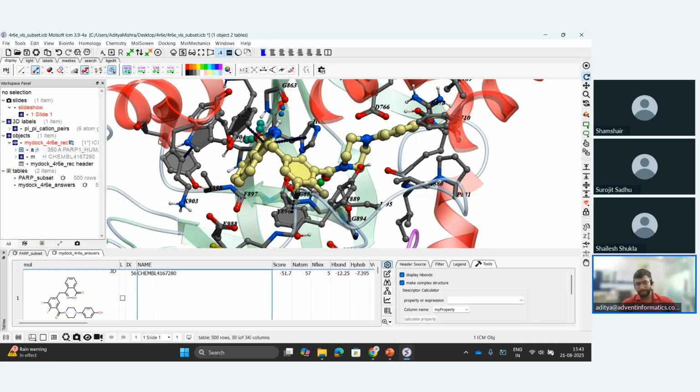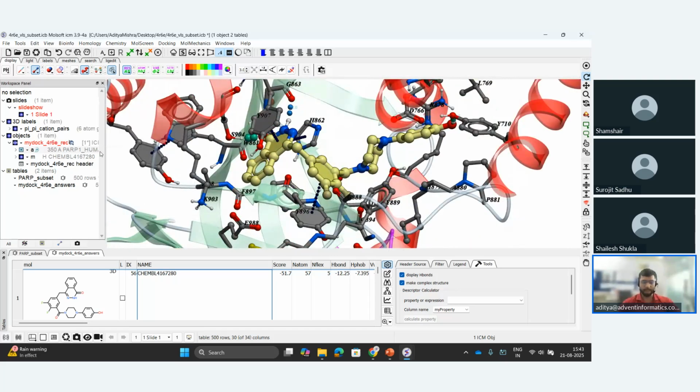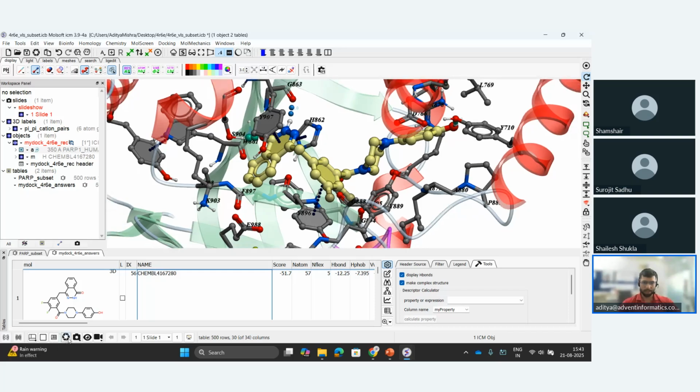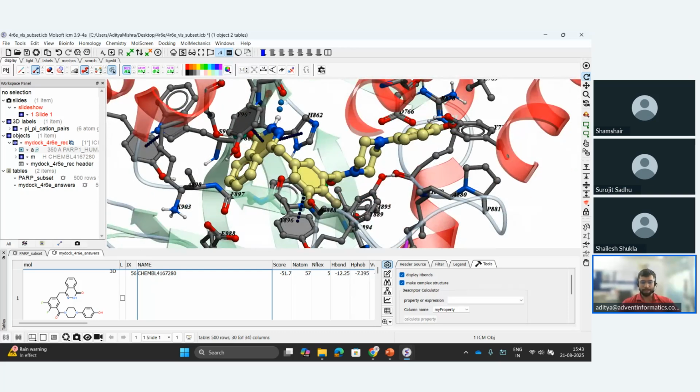And why we are doing it, I'll show you after we complete this analysis part, how we can use this specific file or slides in our Microsoft PowerPoint, right? So currently we have one view here, and you can save them with the same options, save to clipboard and all such things.